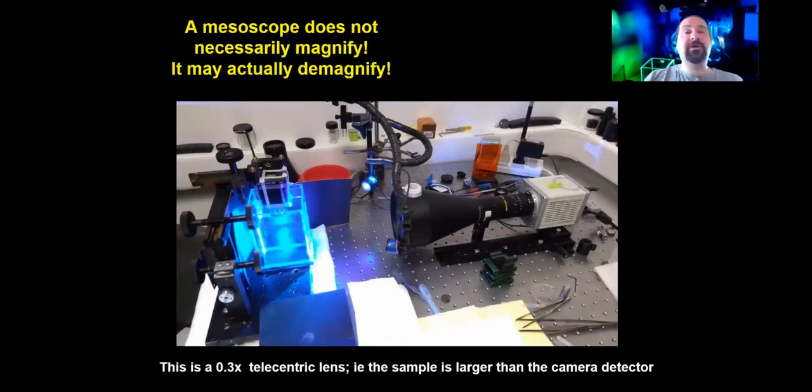So very often in optical tomography, instead of using 1x, 2x, 4x, 10x magnification, as you do with light sheet microscopy, you may actually use less than 1x magnification. Like in this case here, we have a demagnifying telecentric lens, which provides a 0.3x magnification. Now, as long as the chip on your camera has lots of pixels and your optics are good enough to fill those pixels with actual information, then you're getting detail of something that's large, but you're getting detail of small structures inside something that's fairly large.